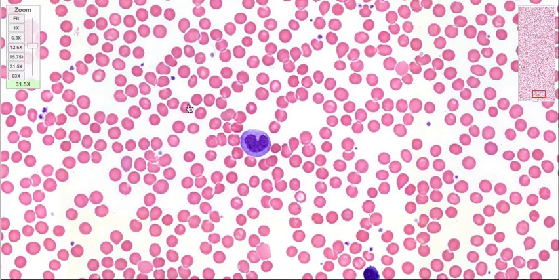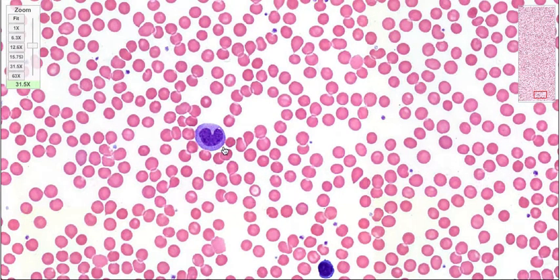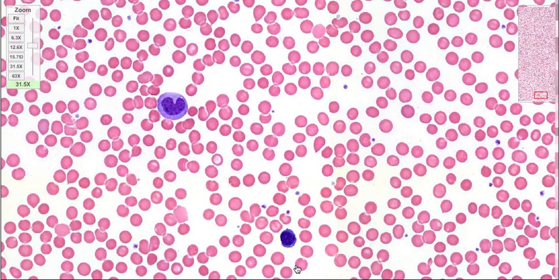So they've got an inborn macrophage function which allows them to gobble up things within that infected tissue that need to be discarded, through the process of endocytosis. So that's a monocyte. There's another T helper cell, or B helper cell.